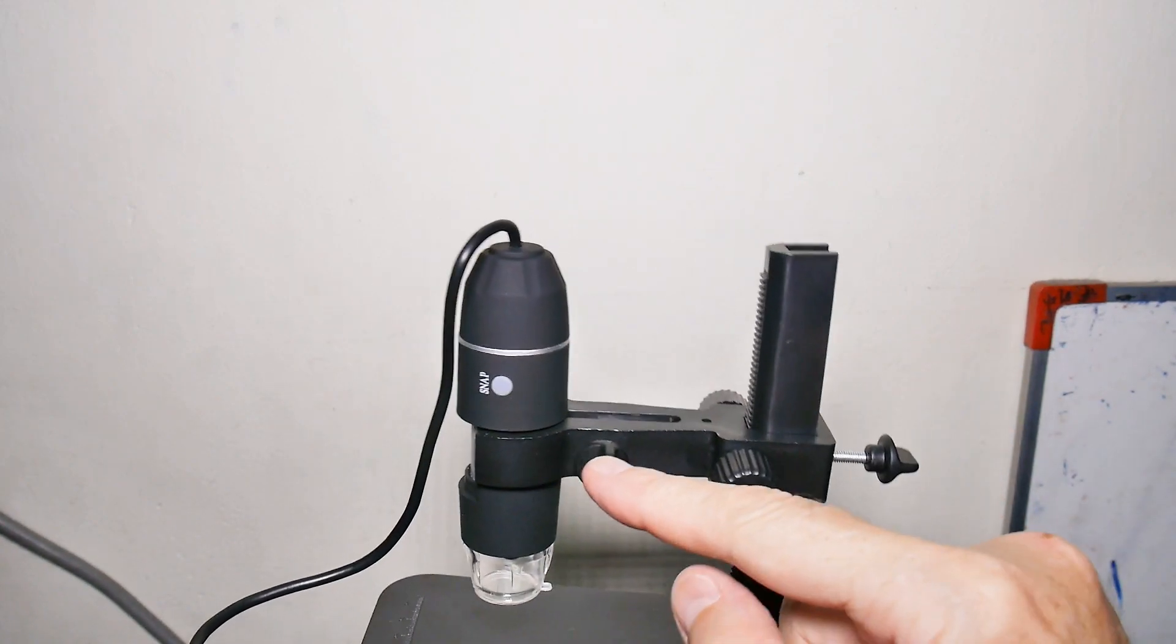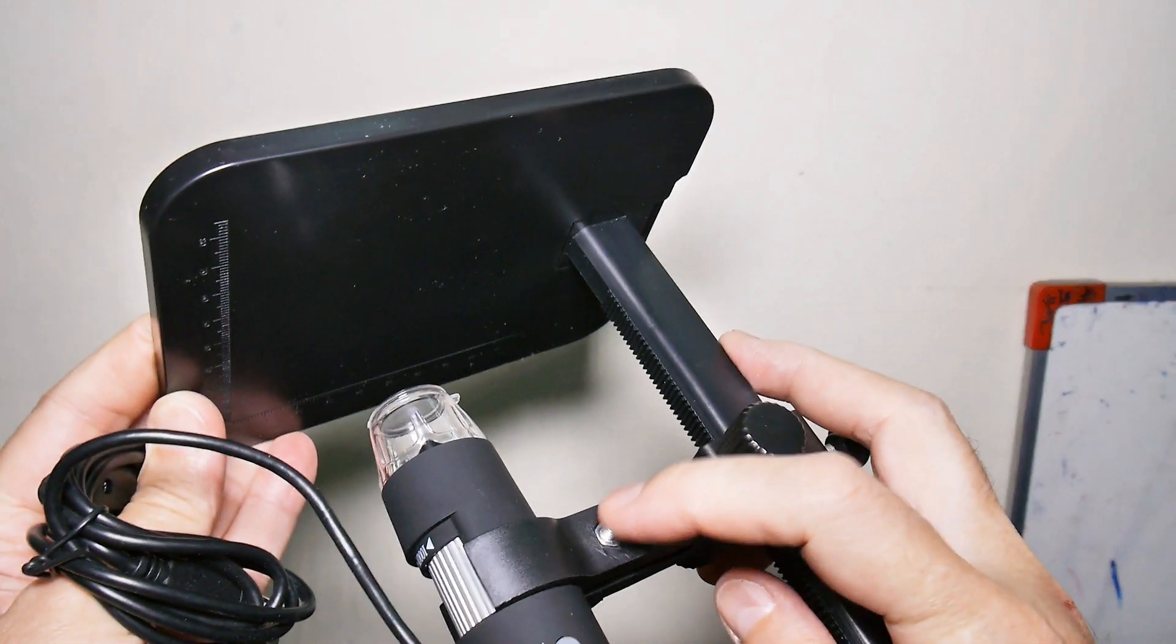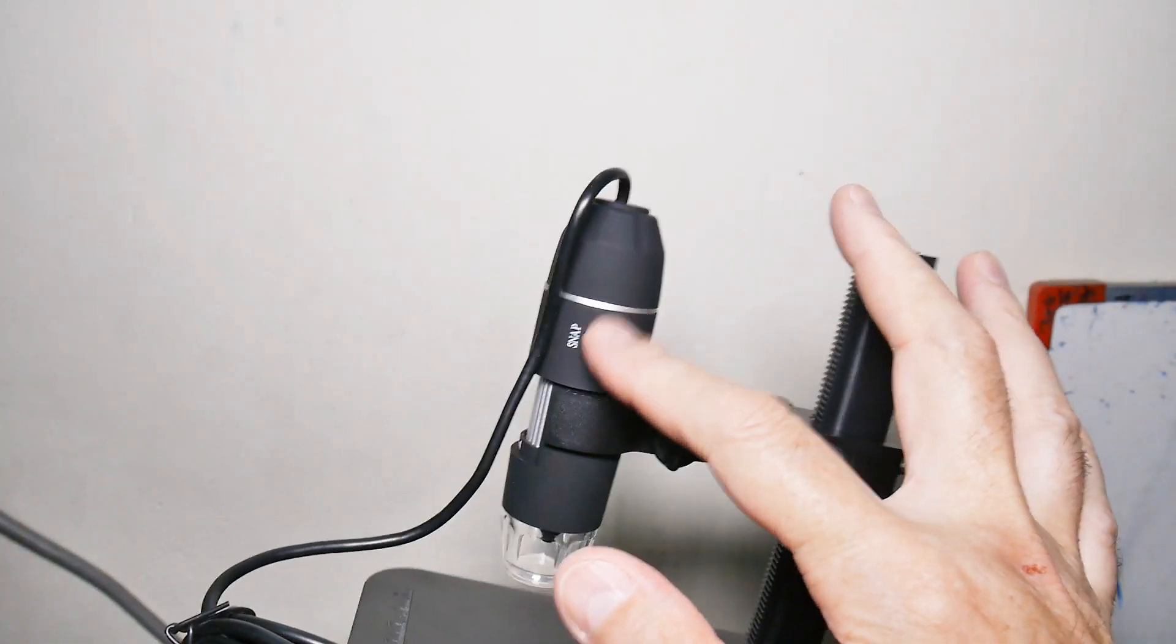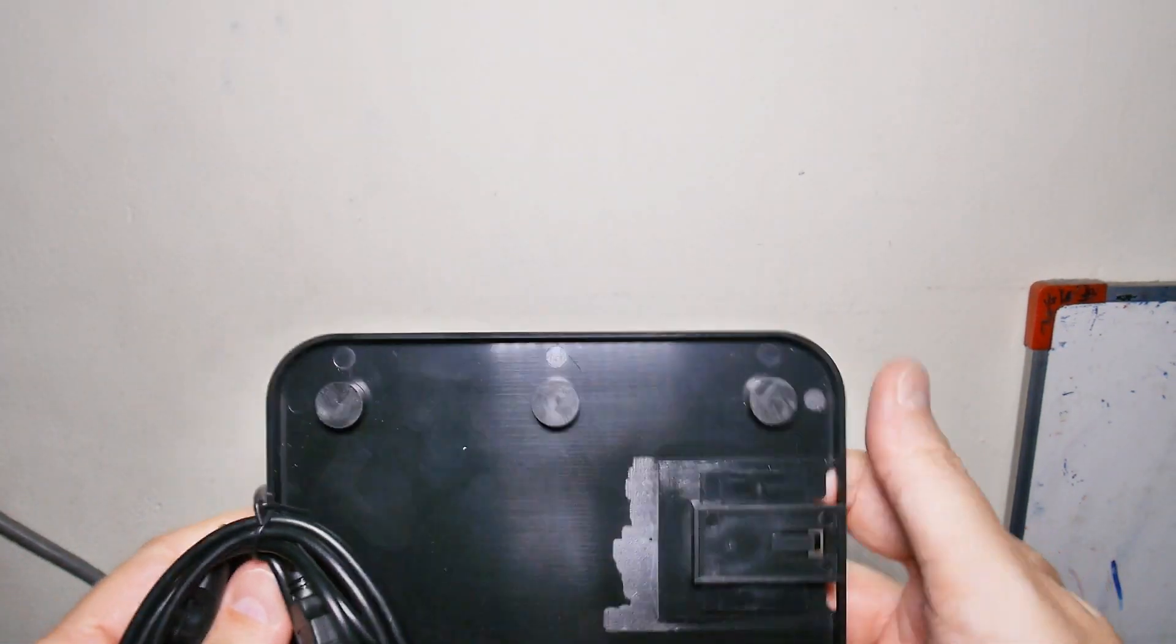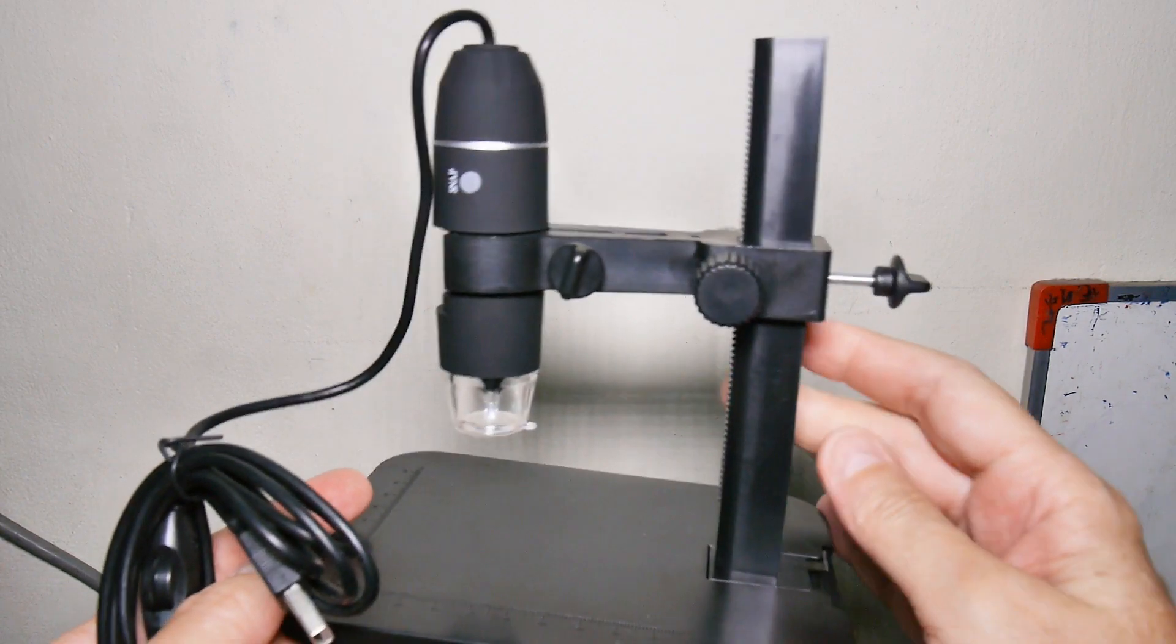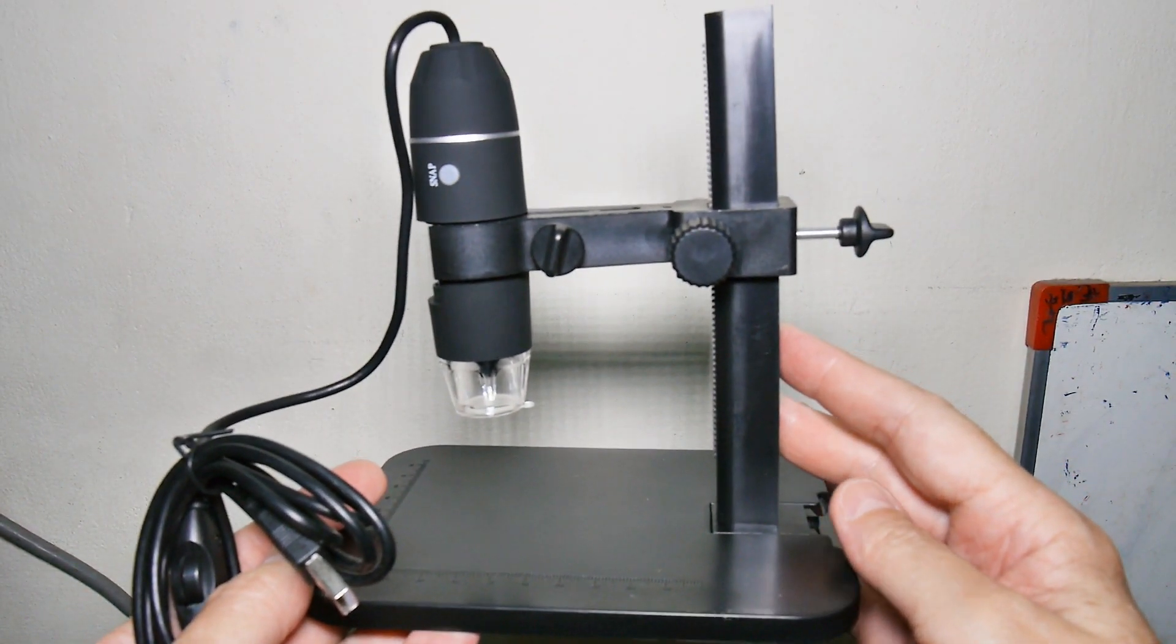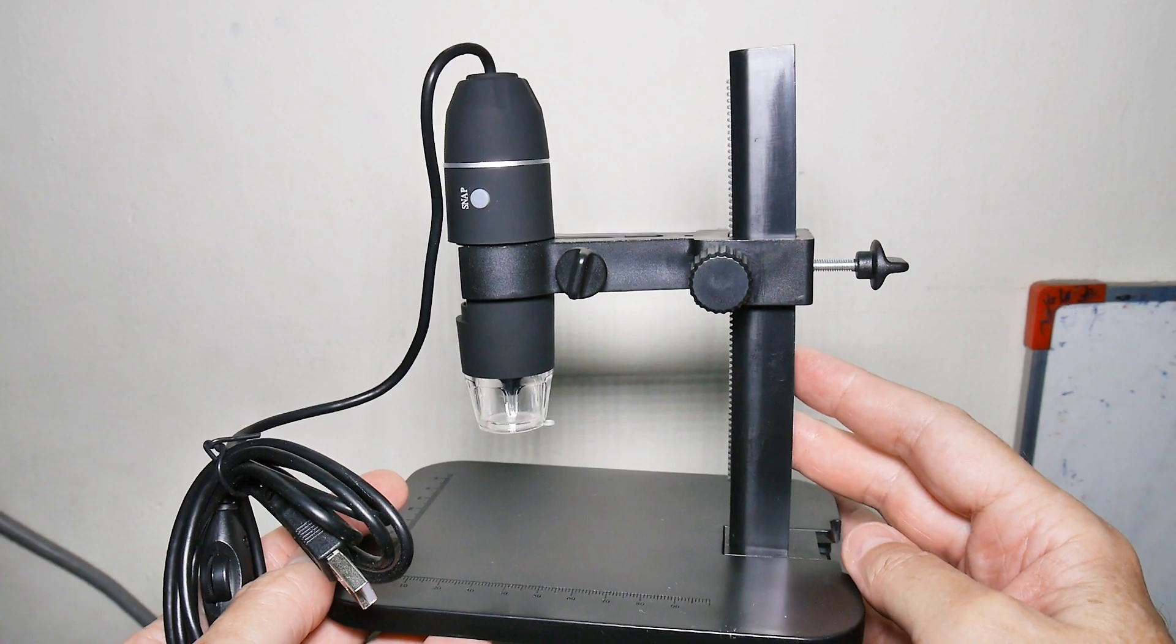I screwed the clamping screw into the back, put this screw in here which just has a nut on that side, clipped in the microscope itself, put the six rubber feet on the bottom, and that's it for assembly. Doesn't get much easier than that.